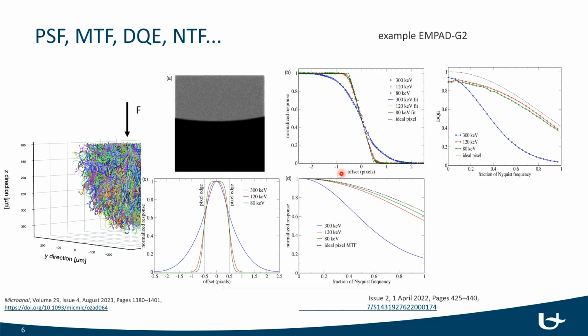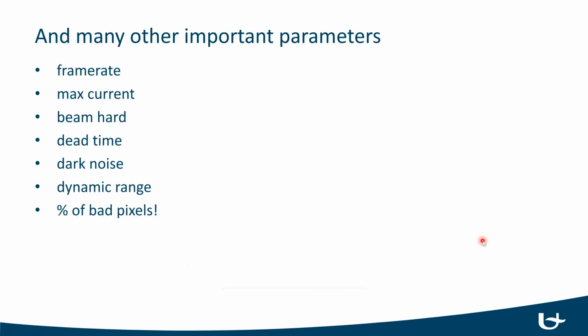Well, there's a lot more to be said. It's not always easy to get such plots. Typically, they appear in papers by scientists evaluating these cameras rather than that you easily get them from vendors, let alone that they are presented in a way that you can easily compare them across vendors. So this might be a bit of a challenge.